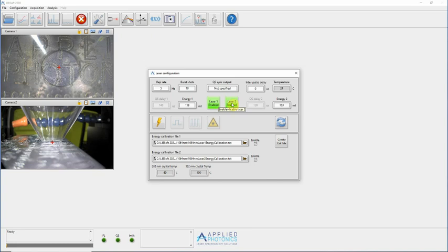When using both lasers, the Q-switch synchronization output from either of the lasers can be used to trigger the spectrometer. This choice is a hardware configuration depending solely on which socket on the laser power supply is connected to the trigger input on the spectrometer. However, a Q-switch sync output selector is provided at the top of the configuration window to be used as an aide-mémoire. This selector does not affect the laser operation in any way, but its setting is added to the parameter configuration file saved with each acquired spectrum as a reminder of the Q-switch sync output used for the acquisition.